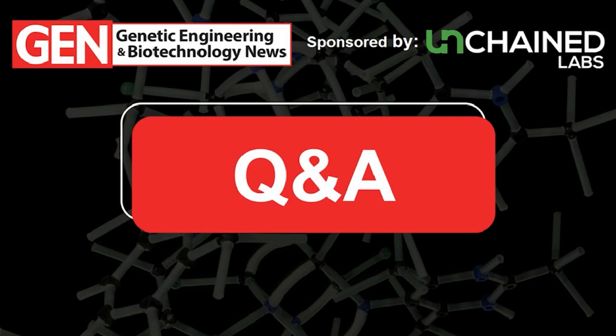First question we have is for Kevin. Kevin, an audience member would like to know, how does the Stunner method compare to other DLS methods?